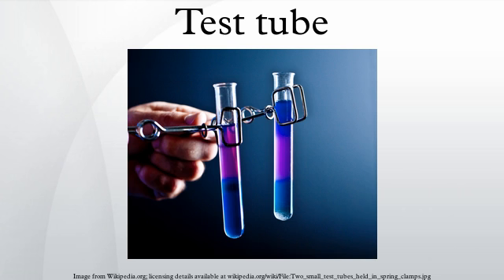Test tubes may come with prepared contents. For example, a blue top tube is a test tube of 5 ml containing sodium citrate as an anticoagulant, used to collect specimens for coagulation screens and testing for glucose-6-phosphate dehydrogenase. A test tube is very resistant and can usually withstand temperatures over 300 degrees Celsius.